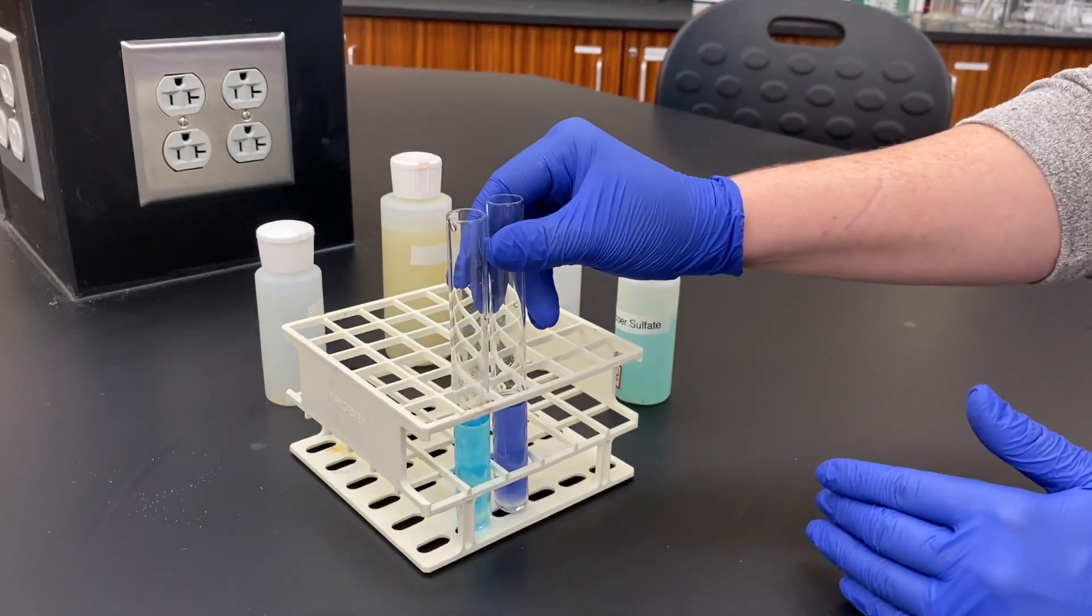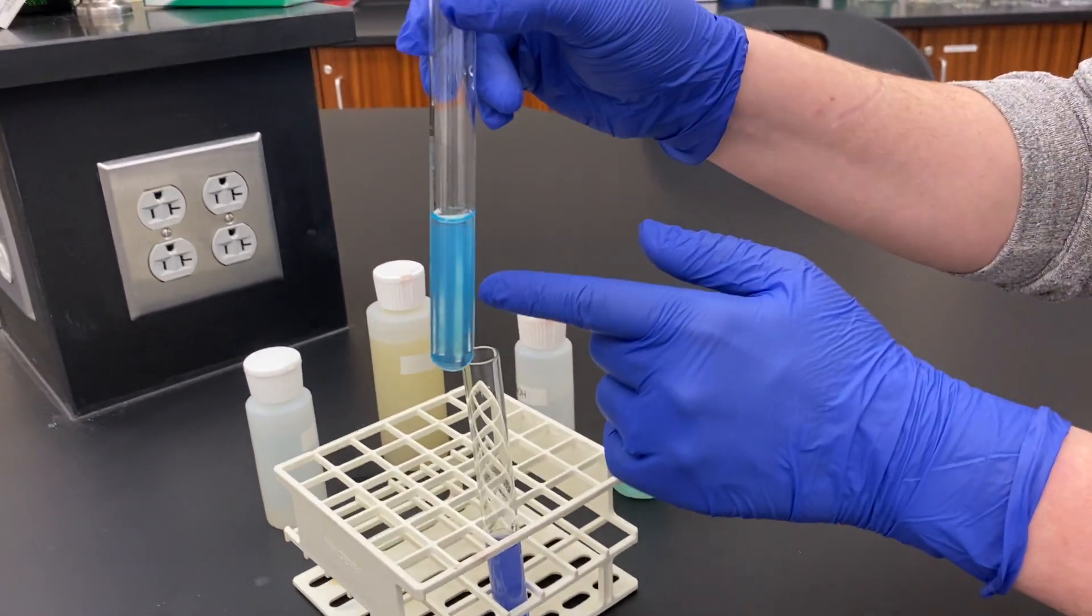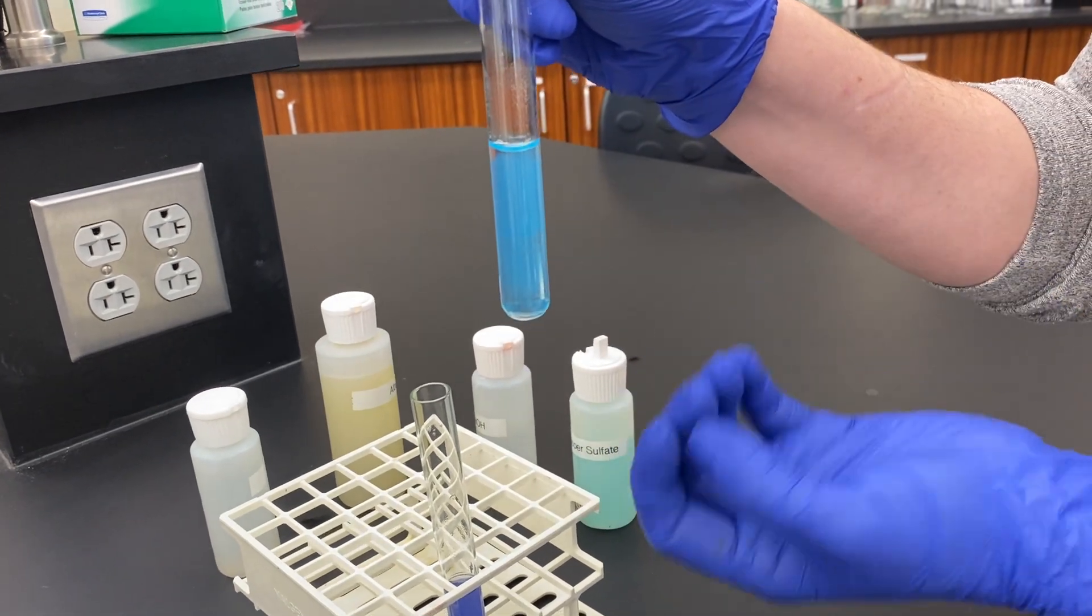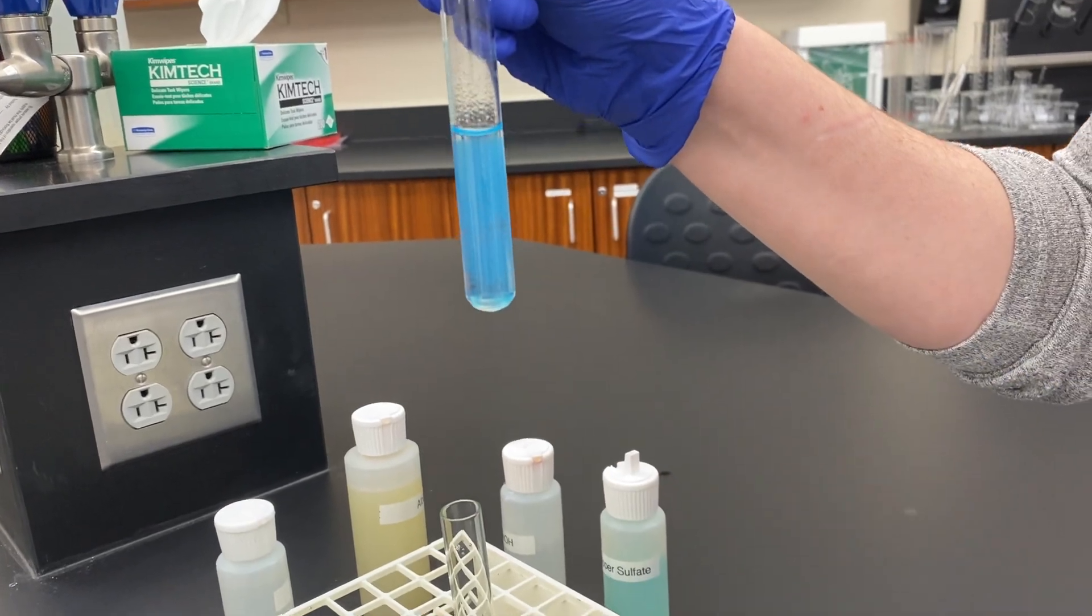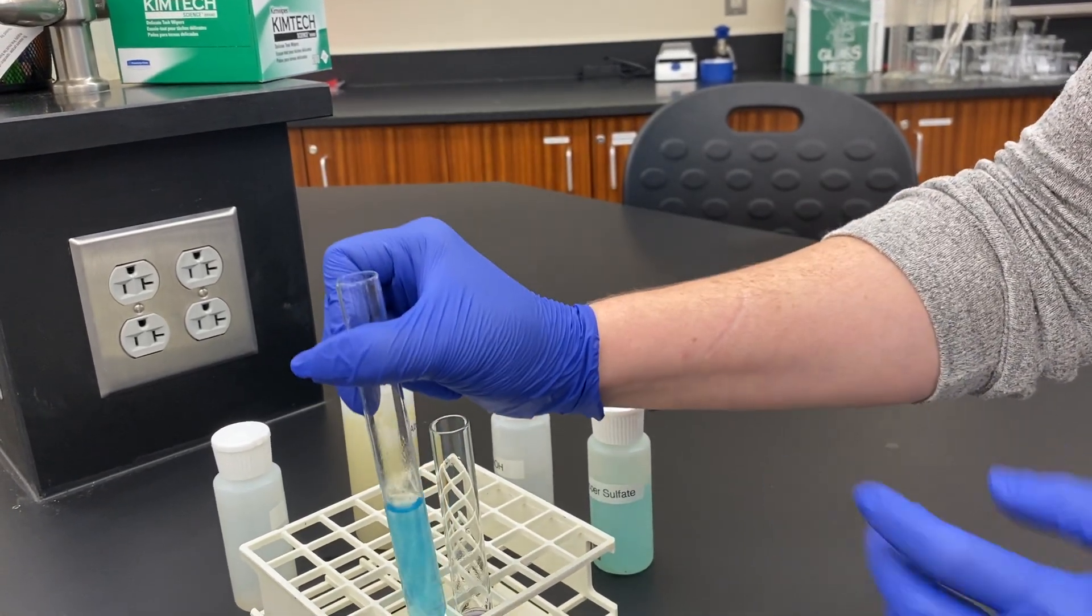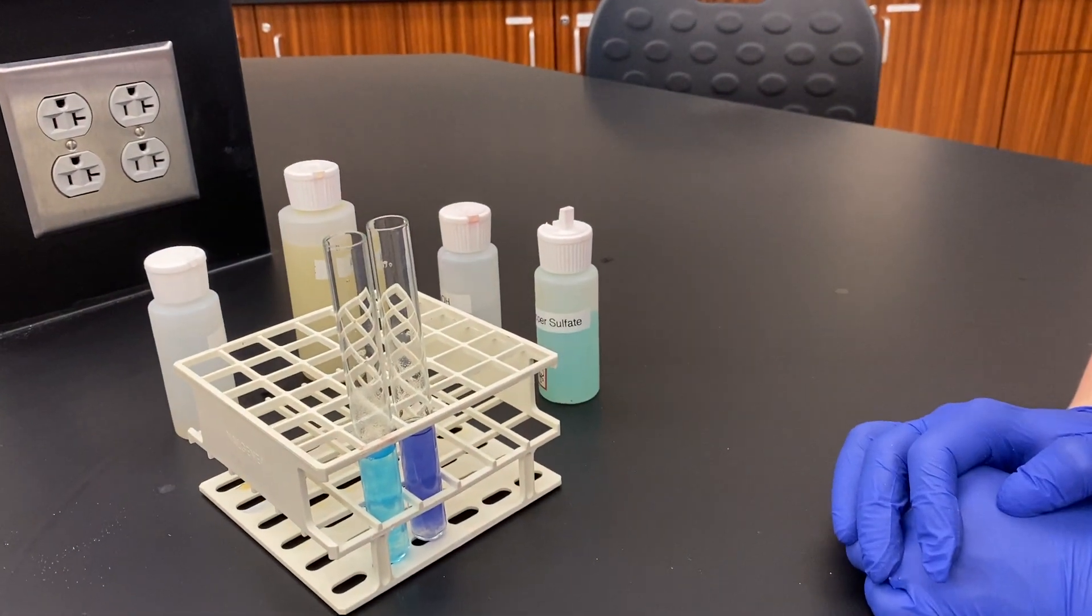So again, very clear, distinct color change between the two. You can see there are flocculates. You can see the precipitate within that solution there, and it's starting to settle a little bit on the bottom. If we were to let this go for another hour, you would see that settling of all of the precipitate on the bottom of the test tube.